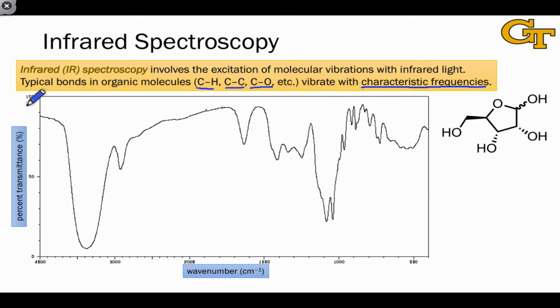Each of the peaks that you see in this infrared spectrum comes from some kind of vibrational motion in the molecule. So for example, the vibrations of the OH bond are associated with this broad peak at around 3,400 per centimeter. Vibrations of the carbon-oxygen bond are associated with this peak around 1100, and at a somewhat higher frequency we find vibrations of the carbon-carbon bonds.